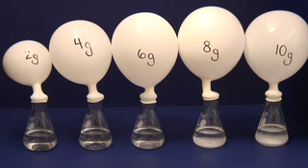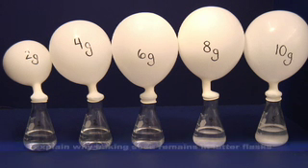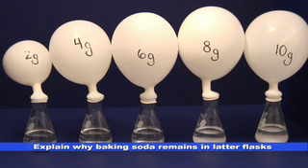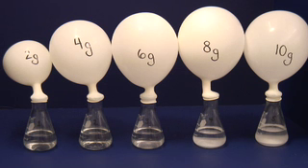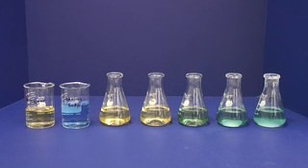Examine the results of your calculations and compare them to the observations made in this demonstration. Explain why the balloons initially increase in volume, but then remain constant. Explain why solid remains in flasks 3, 4, and 5, but not in flasks 1 and 2. Explain why the bromothymol blue is no longer yellow in flasks 3, 4, and 5.